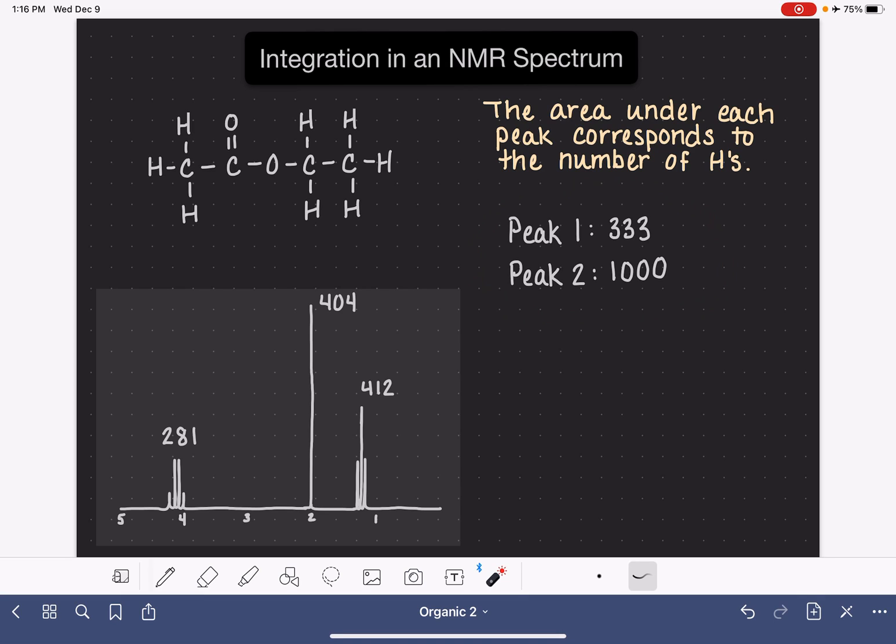Let's analyze these integrals. The first thing I want to point out is that the integrals only correspond to the number of hydrogen atoms. They are not equal to the number of hydrogen atoms. So this is not saying that peak number two is coming from 1000 hydrogens. These numbers just simply represent the area under the peak in units that we don't know. Our job is to recognize that these integrals represent the relative ratio of the hydrogen atoms in each peak, and turn this ratio into numbers that are more reasonable for the number of hydrogen atoms we would expect in a molecule.